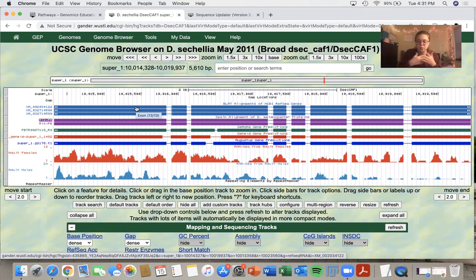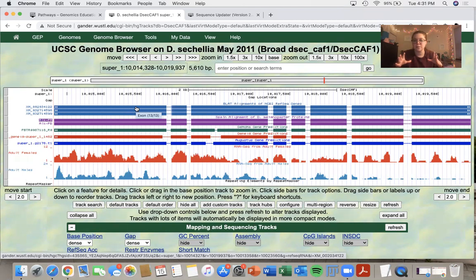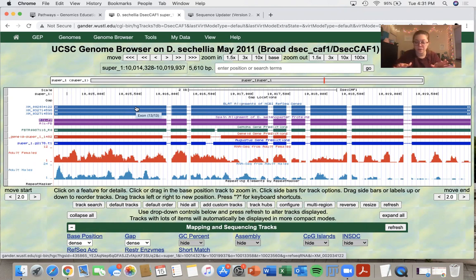So similarly, you find multiple assemblies in this one region, and you can check which sequence is the anomaly. I hope that was helpful to understand.